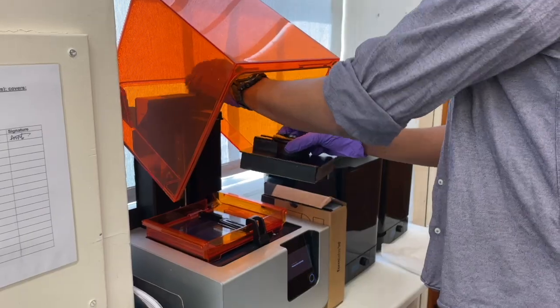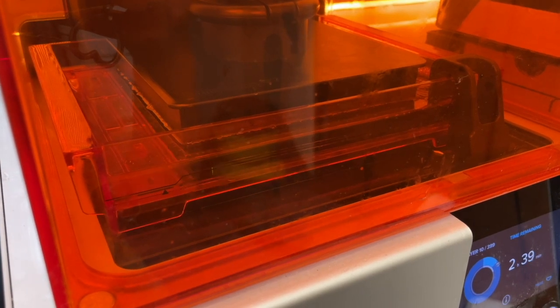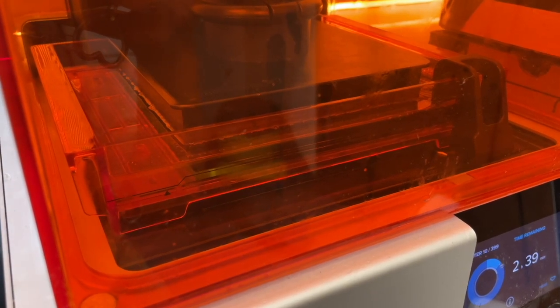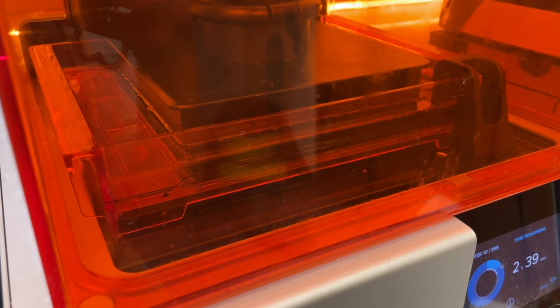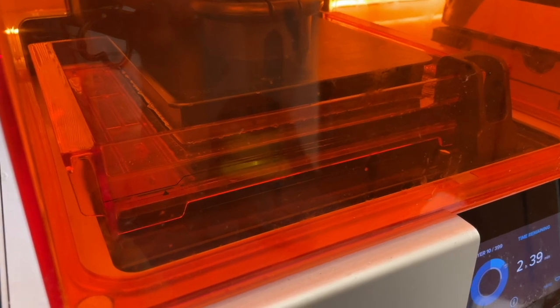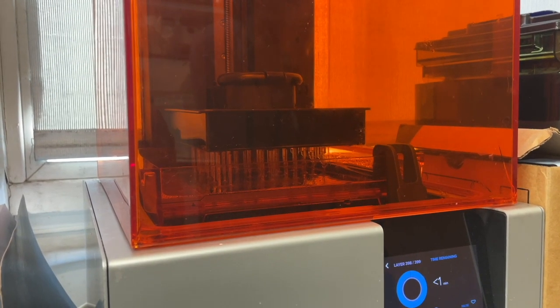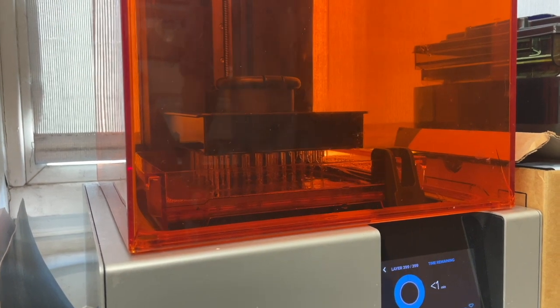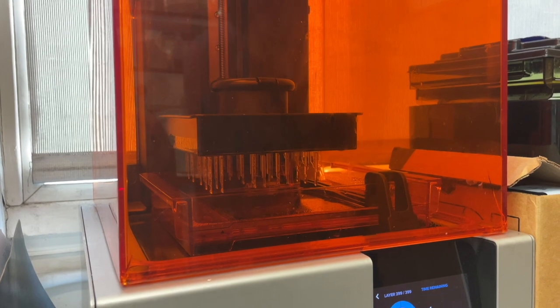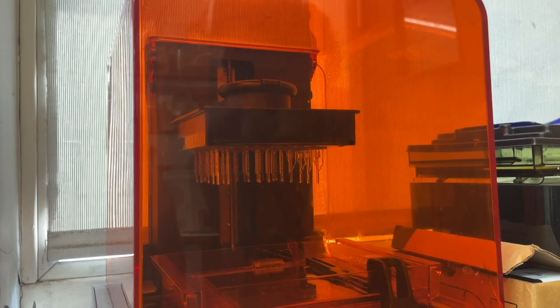Once you are happy with the number, orientation, and raft supports of your objects, printing can be started. The resin mixture with drug is placed in the tank and the build plate is loaded into the printer. The printer then starts to build the object by moving the laser in a raster pattern across the resin tank, in a layer-by-layer fashion. The cover for the printer is orange to stop ambient light from photocuring the resin and to stop laser light escaping from the printer. The printer shows the number of layers needed to build the complete object, as well as the number of the current layer being printed, so you know how long printing will take.